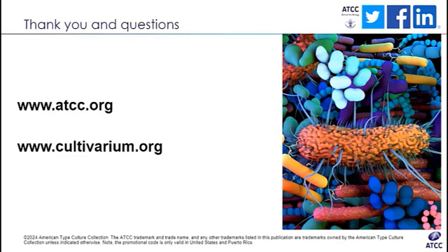The first question is, how many organisms has Cultivarium worked with? Thank you very much for the question. We have currently worked with more than 130 strains from 130 species in the lab.